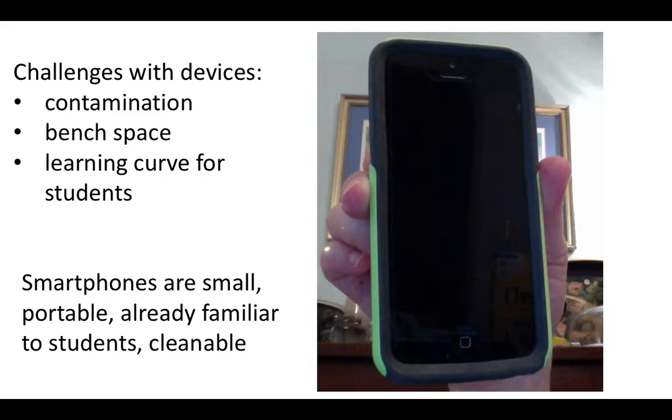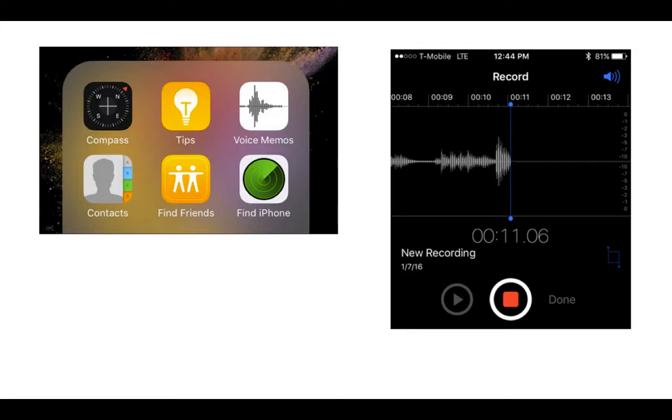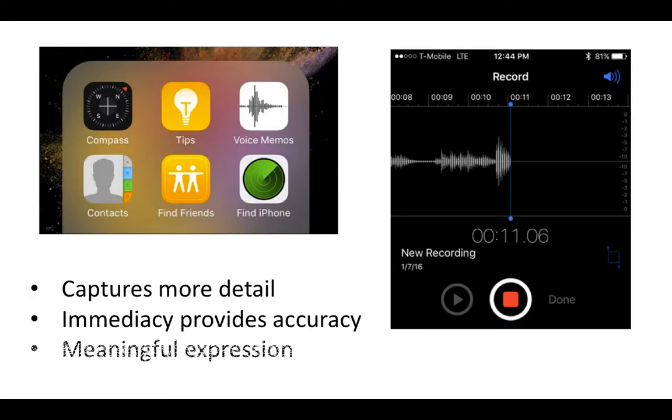Students could record their observations of how they performed the procedure immediately after completing it for later review. A voice recording affords the students the ability to hear their description expressed in their own words, with inflections and expressions that are most meaningful to themselves.